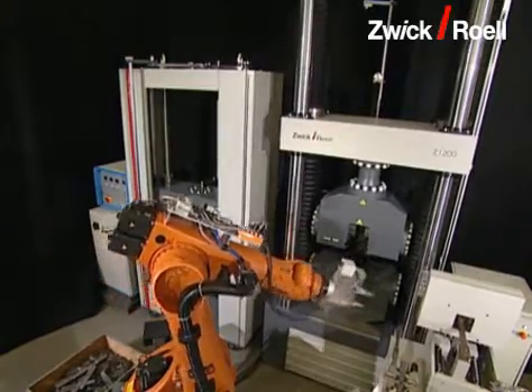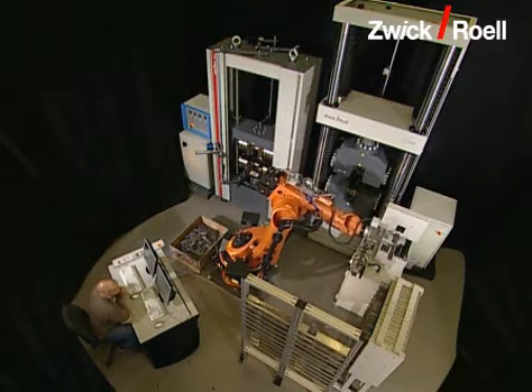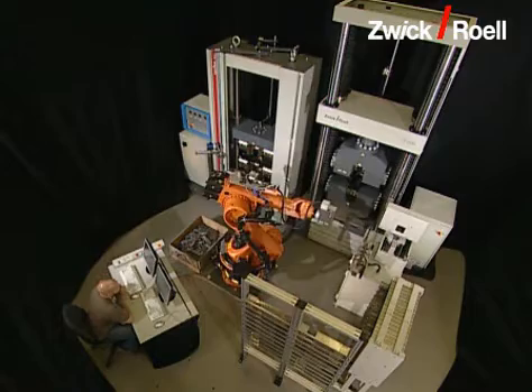The fully automatic polar type testing system has been designed for the testing of heavy plates, optionally flat material or specimens from tube cutouts.